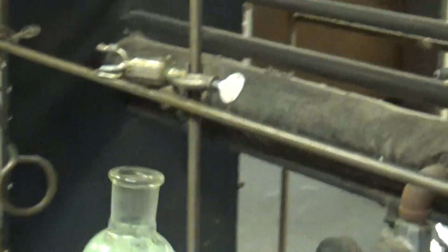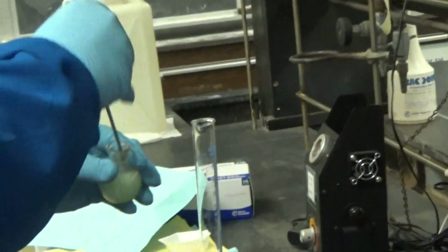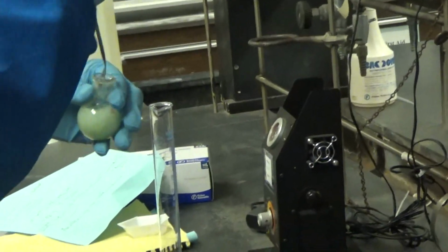Now, does it look kind of crystalline-ish? It does look crystalline. Yeah, it looks like something we can filter. A lot of white solid. That's what we want. And the copper will stay dissolved, I think, and go through, right? So you're agitating it a bit. And then you're going to dump it in.